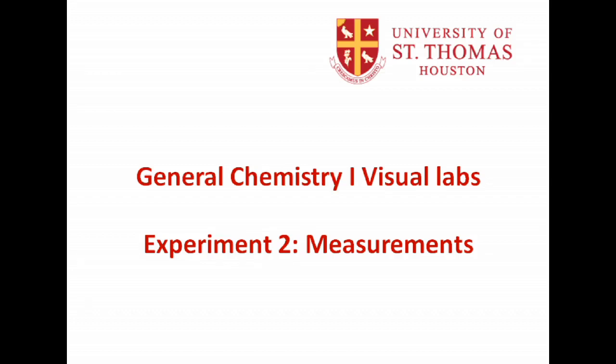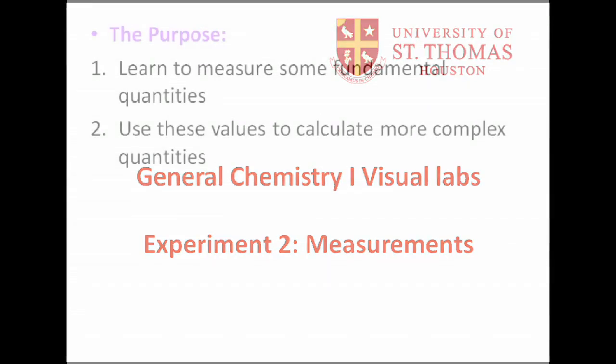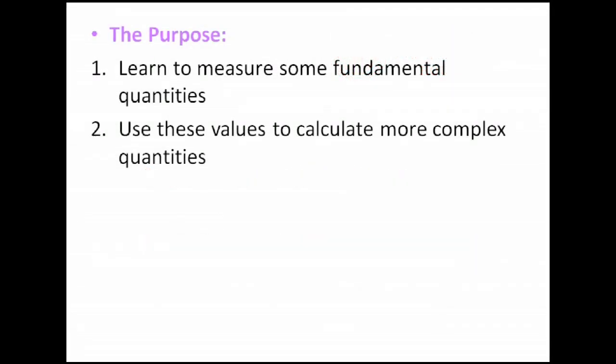Hello, welcome to the University of St. Thomas General Chemistry 1 Visual Labs, Experiment 2 Measurements. The purpose of this lab is to learn to measure some fundamental quantities and to use these values to calculate more complex quantities.